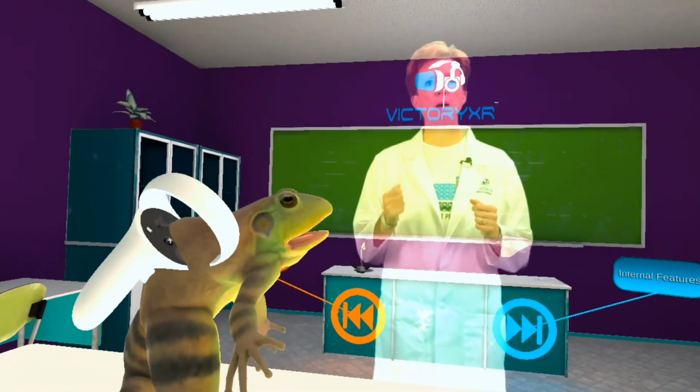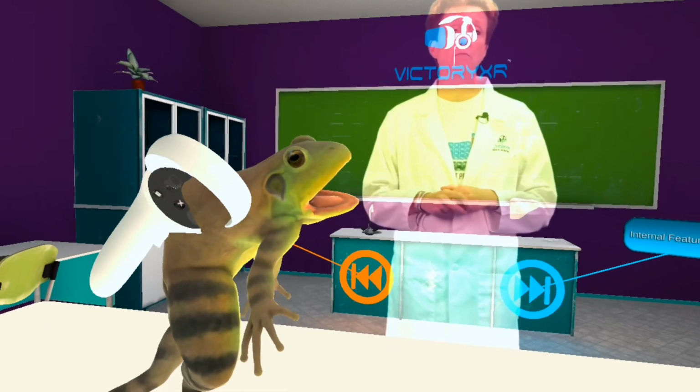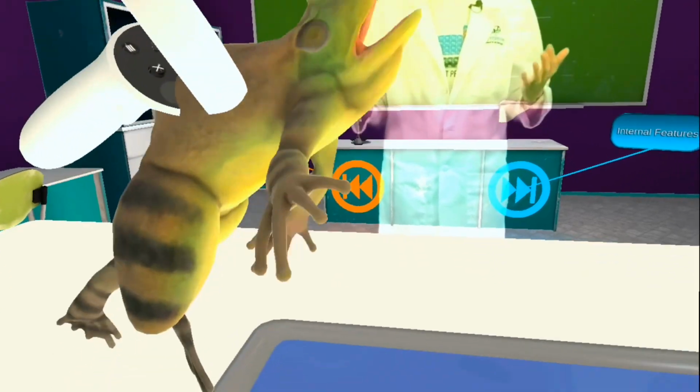Pick up the magnifying lens from your tool tray and look closely at the mucus glands. Mucus glands will secrete as needed.